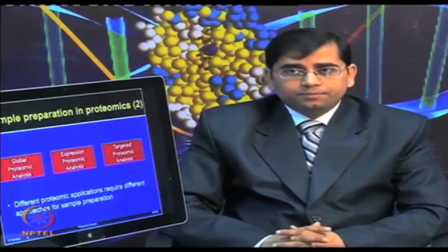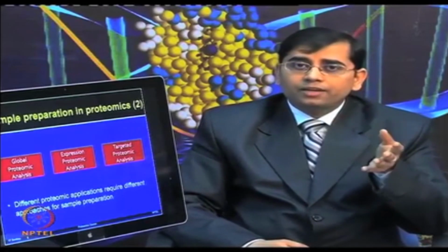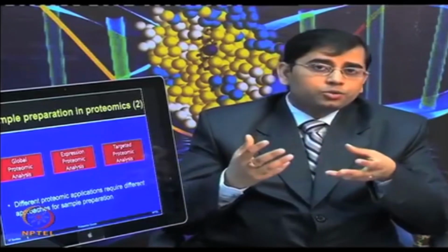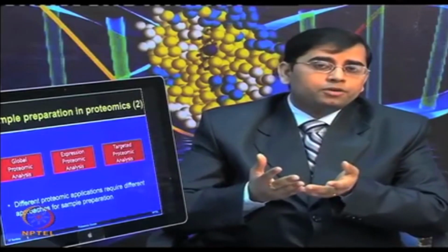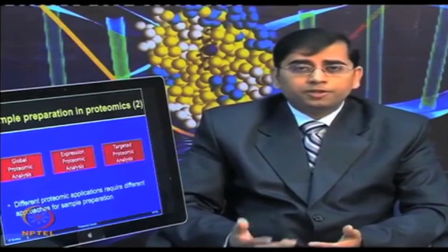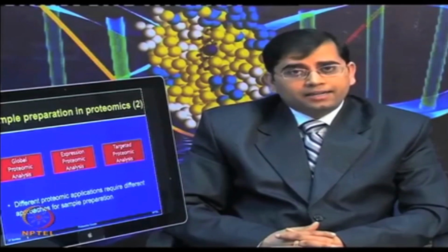Targeted proteomic analysis: if you are very focused on a given organelle or a given sample type, often you would like to know what is happening in that particular proteome, for example, the mitochondrial proteome. So, one needs to try different types of strategies when thinking about performing a sample preparation. What is your objective? Whether you want to do global profiling or expression profiling, in either case you need to extract all the proteins present in that particular target sample.